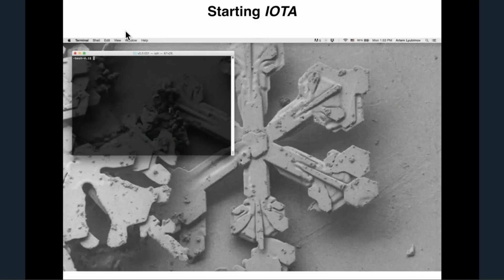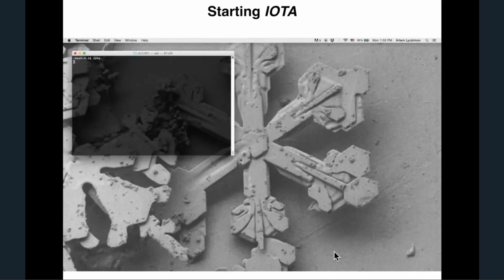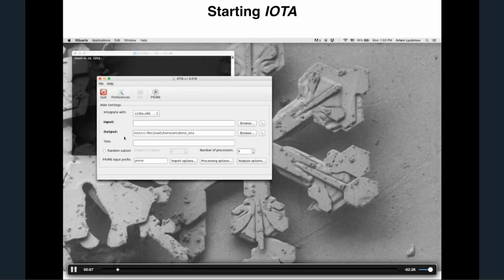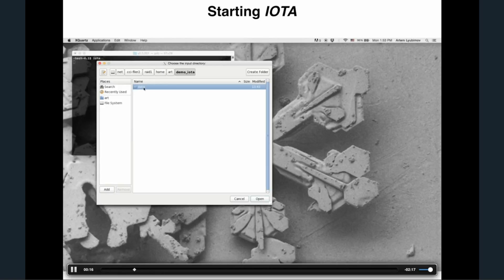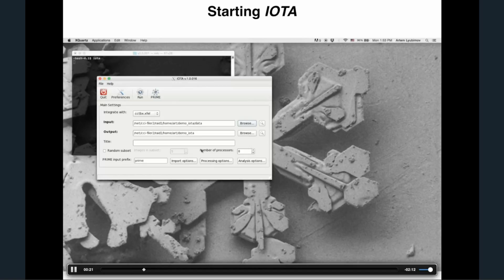Now let's go through a quick demo. I have a recorded video to make sure nothing crashes over our Wi-Fi. You start by just typing IOTA, and the interface pops up. You can select your back-end here — cctbx.xfel or dials. We're going to go with cctbx.xfel. You browse and point IOTA to your data folder, and you can select any output folders.